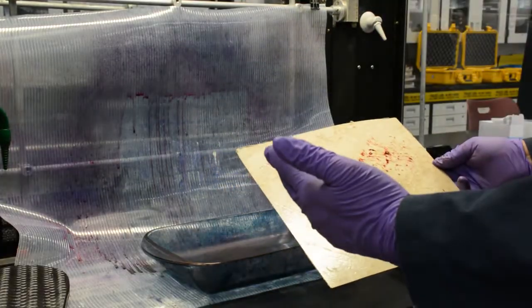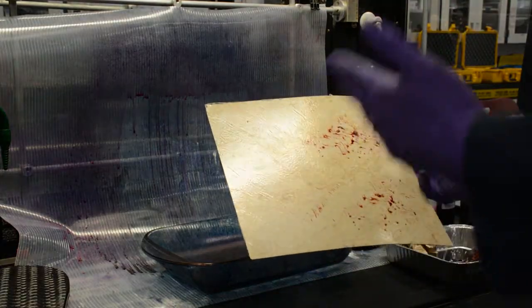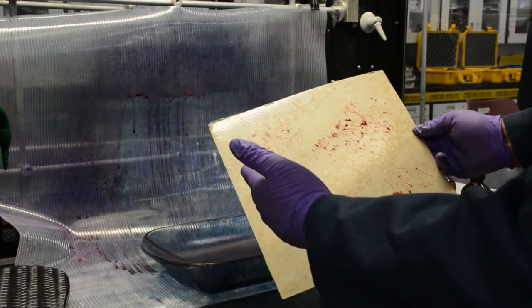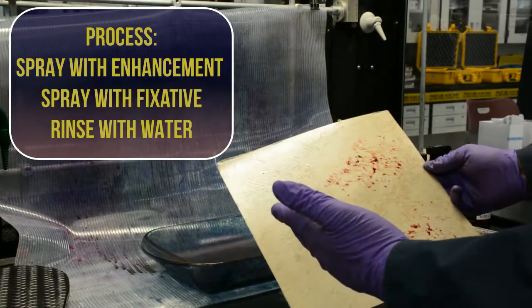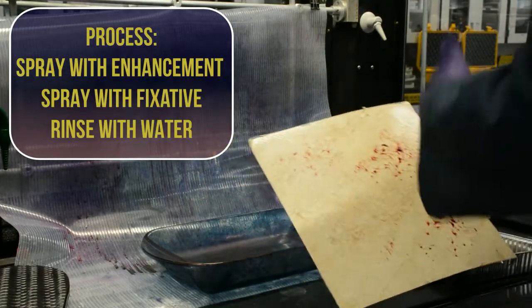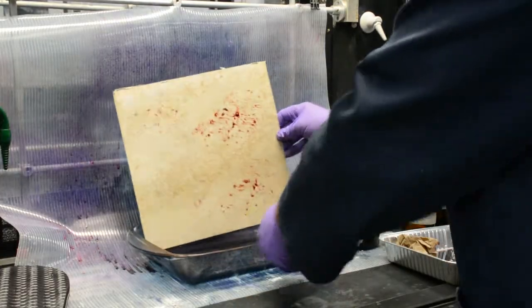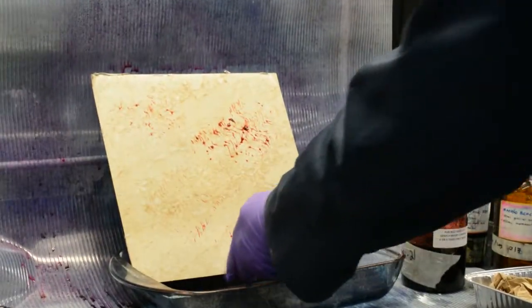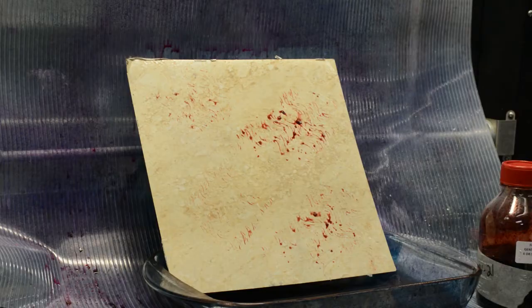Now, as we recall with the Hungarian red, it is a 2-step process. There's the application with the sprayer of the Hungarian red, and then it's rinsed off with the distilled water, and in our case here, just using the squeeze bottle. The Amido Black is a 3-step process. So it has the Amido Black, then it has a fixative, and then it has the final rinse. So it's 3 instead of 2 steps. So we're going to do a similar procedure here by putting it up on a vertical plane in our dish.